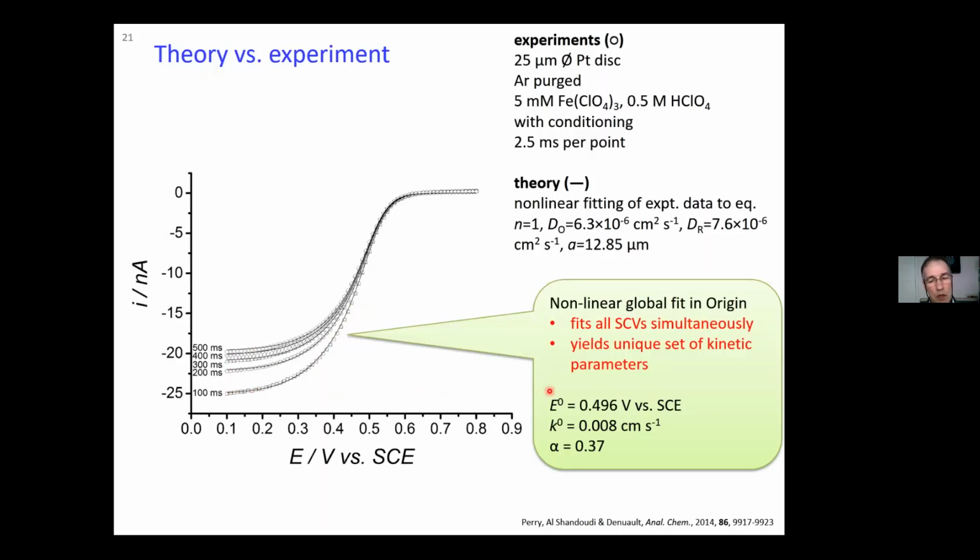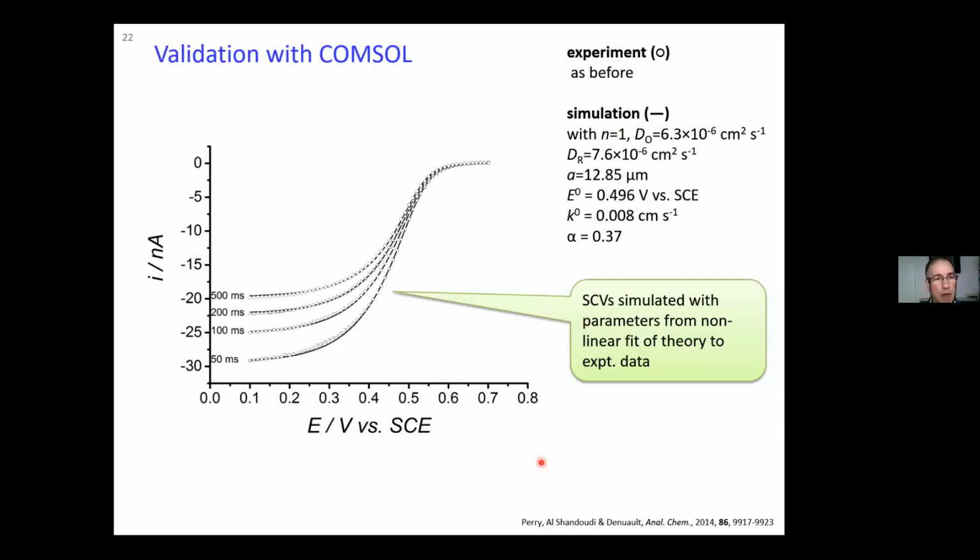And from this global fit of all the potential time current data set values, we extracted the electron transfer kinetic parameters from the experimental values. So this modified equation turned out to be quite powerful. We then went on to validate the experiments, the fits, with simulations.